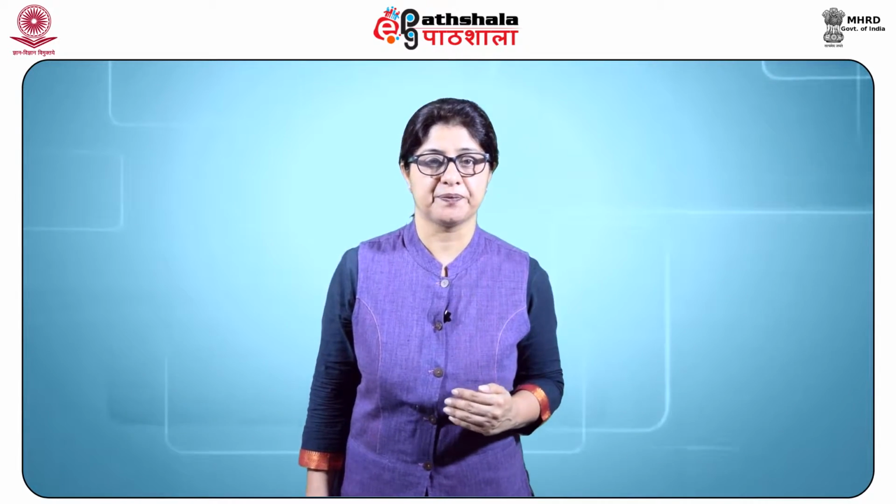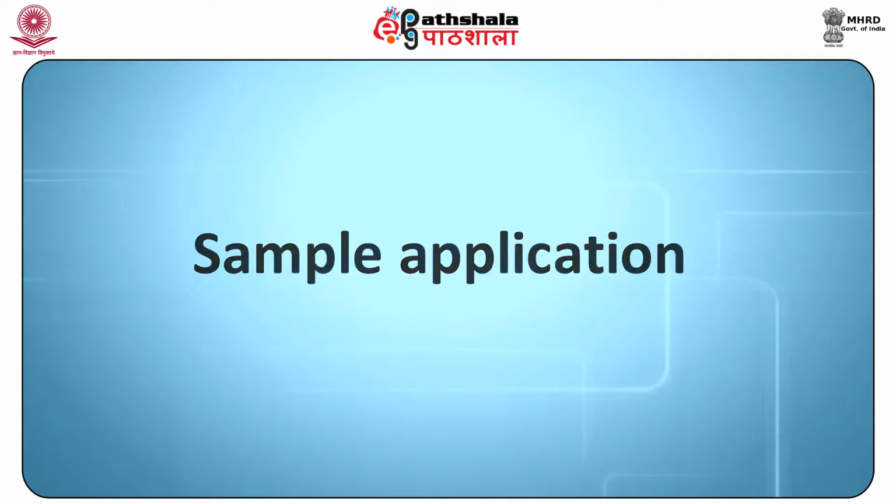TLC plate. Sample application. A Hamilton microsyringe is generally used for transferring the sample solution to thin layers for quantitative work. However, the use of capillary tubes is preferred for qualitative analysis. The solvent used for the sample solution should be volatile and as non-polar as possible.